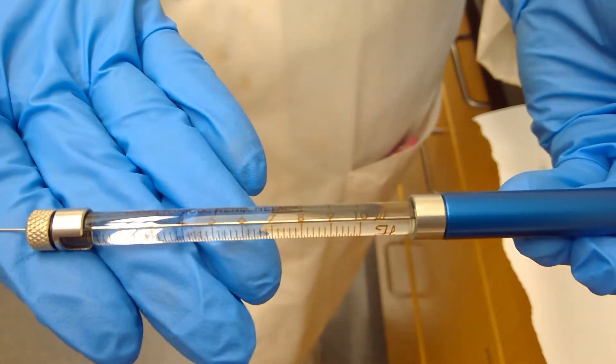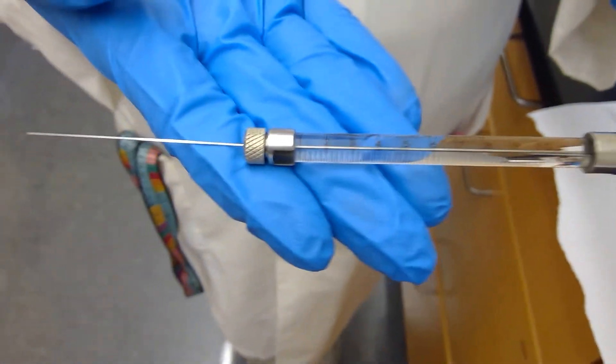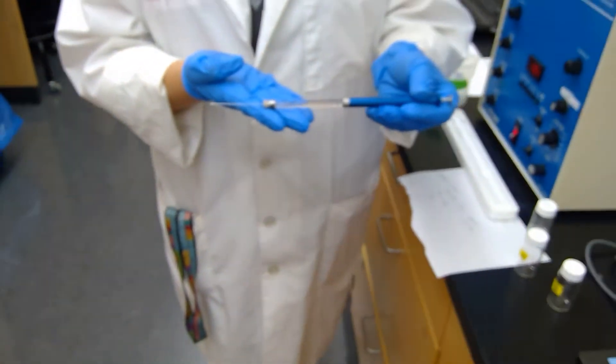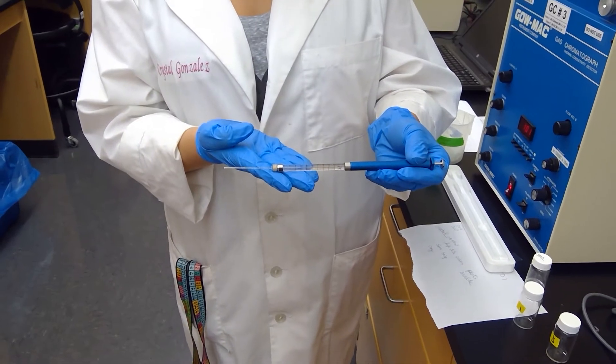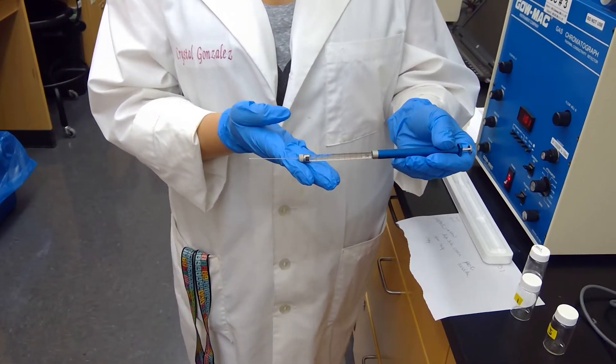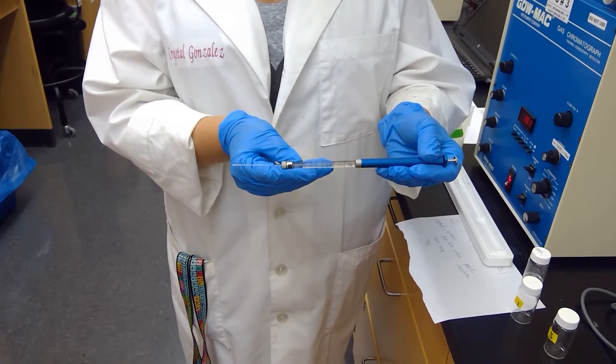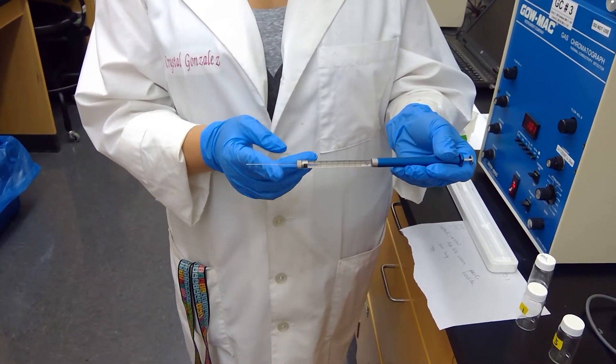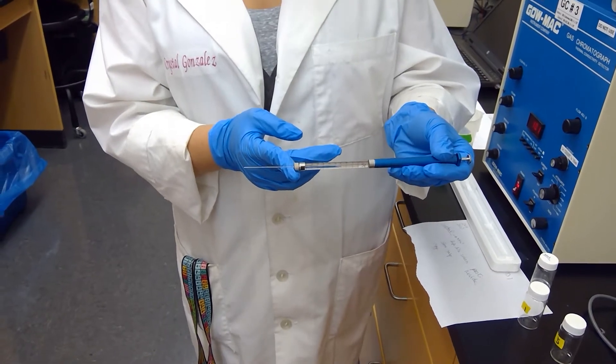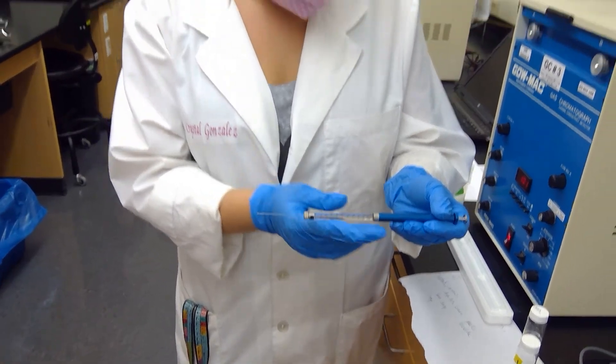So I'll go ahead and turn the scale towards you. And the reason why we're using this Hamilton syringe is because we want a very small volume for our gas chromatography machine. We're actually only going to inject about one or two microliters of sample and it has to be stainless steel metal here because our gas chromatography machine is actually quite hot.